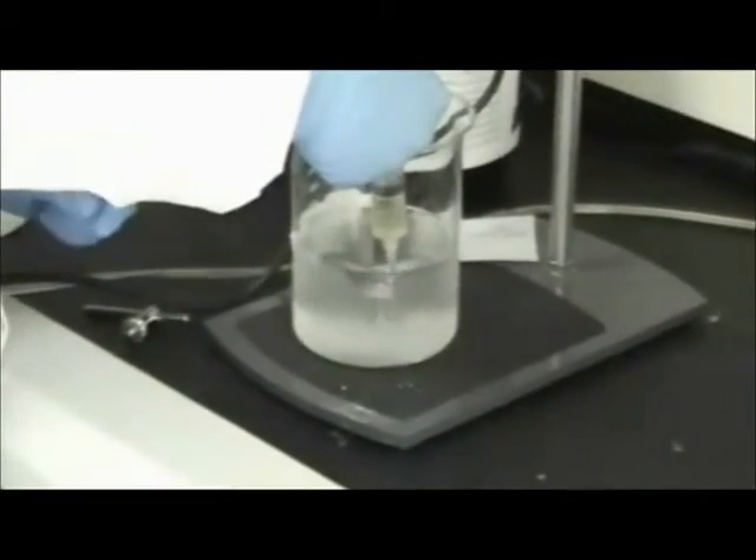You can already see that the spheres are being created. Now with the stir bar constantly mixing the solution, it's not going to allow the two phases to separate. And the solvent that we use to dissolve our polymer will evaporate and leave behind solidified small spheres. We will leave it on for 24 hours for the solvent to evaporate. And once the microspheres are created, they'll be in this water solution, which will then dry out and we'll just be left with the microspheres, which we will use the shaker to separate them by size.